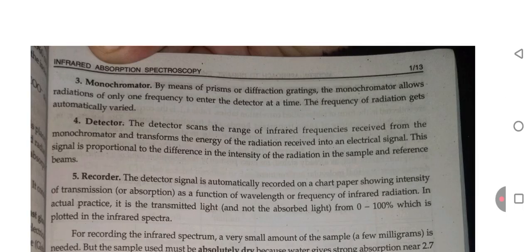Monochromator. By means of a prism or diffraction grating, the monochromator allows radiation of only one frequency to enter the detector at a time. The frequency of radiation gets automatically varied.